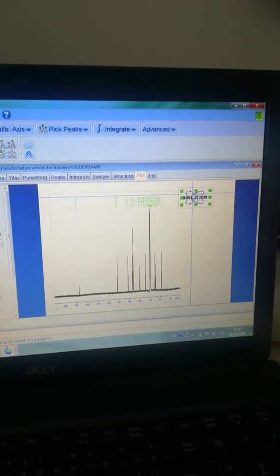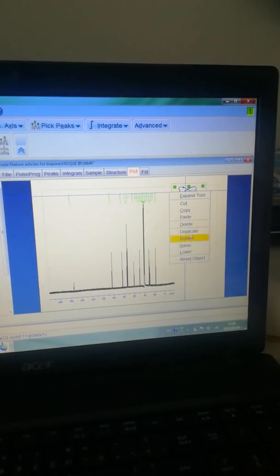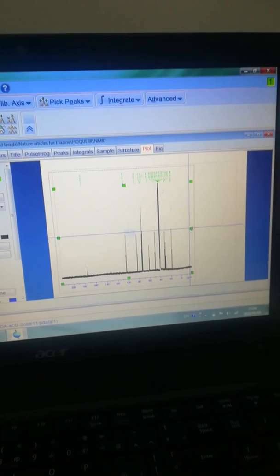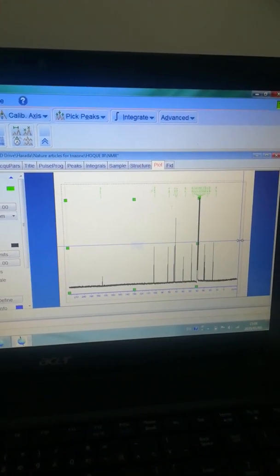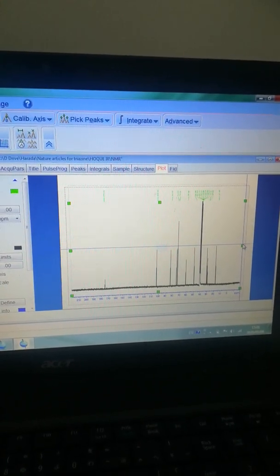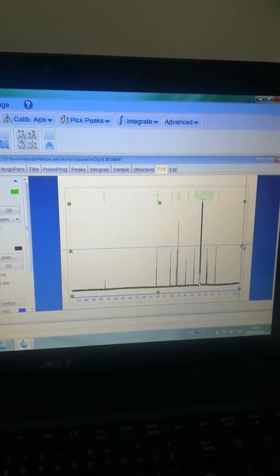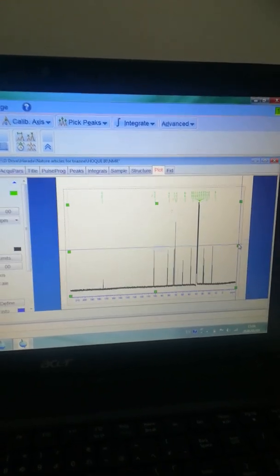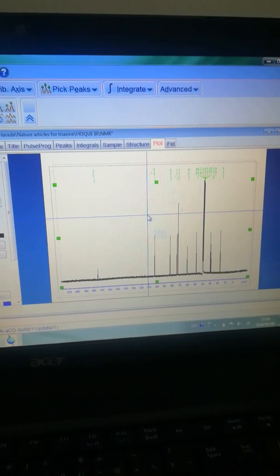You don't need the scale or some extra information so you can delete those things. In the case of carbon-13 NMR you don't need to put integration. The automatically created spectrum has integration included, but you should delete all the integration — keep only the peak picking. Now the spectrum is ready.